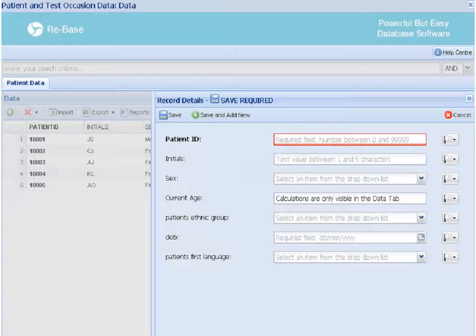Note, if the administrator had set any question default values, they would automatically be entered into the fields when clicking the Add button. Questions that appear in bold are ID questions. They were set by the administrator as the questions that will uniquely identify this record.